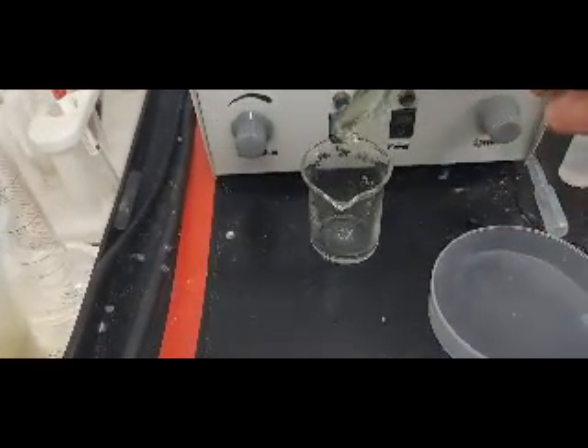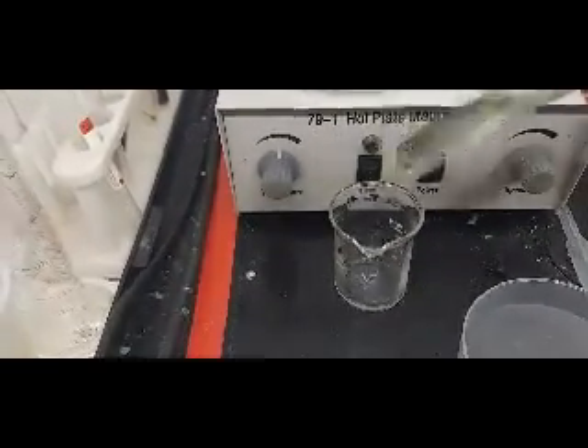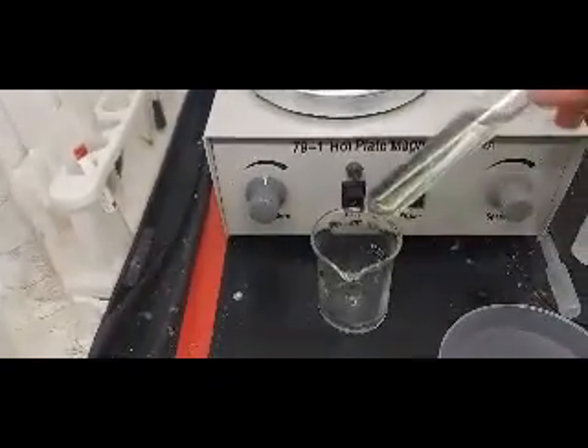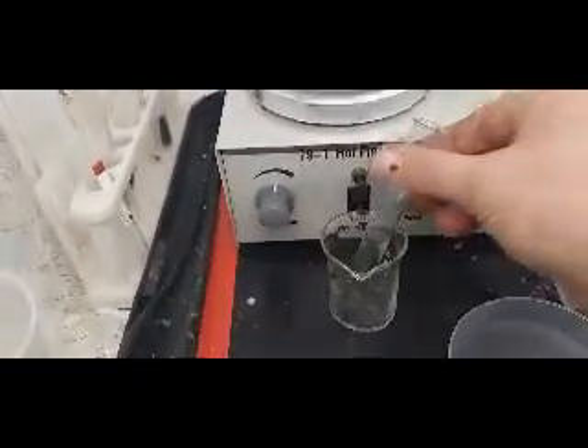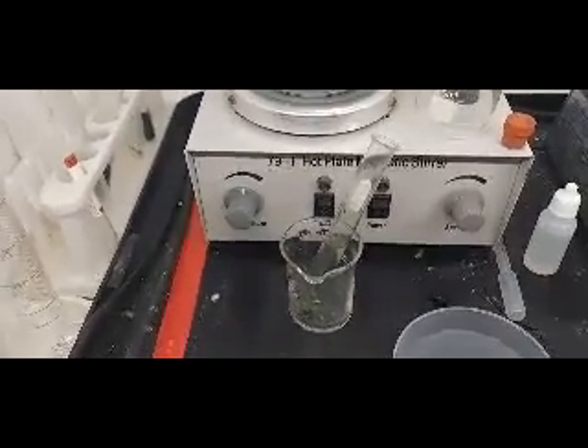I'm going to predict 95% silver. I think it's time to call this one. There is a very, very small piece of what I'm assuming will be gold left over. We're going to call this dead on at 95% silver.